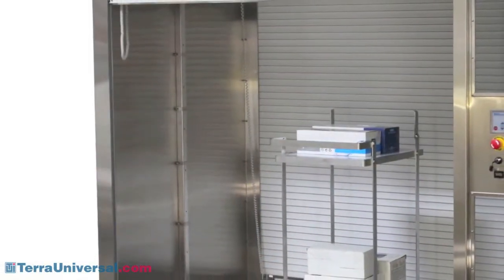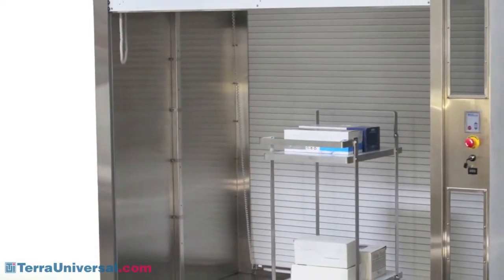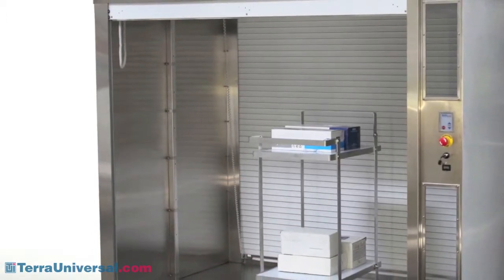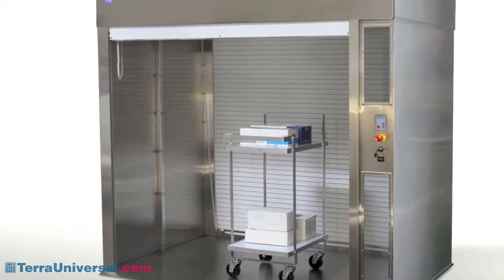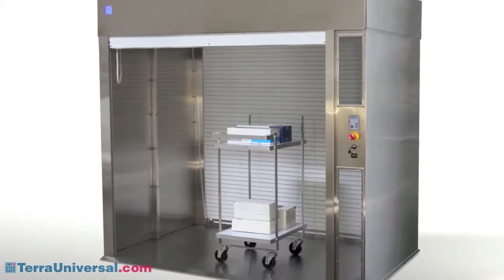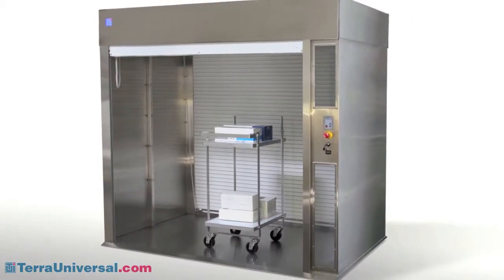An optional air shower directs HEPA-filtered air through nozzles located on each side of the unit. The high-velocity, particle-free air blows away surface contaminations from the cart and cart contents before they pass into the clean room.